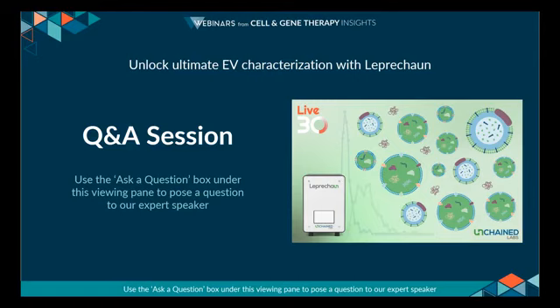As I say, we have an inbuilt negative control on each Luni, so if there is any non-specific binding, or if there's any fluorophore left over that hasn't been removed and is unbound and is sticking to the chip, to the Luni surface, then you will be able to see that, and it might be an indication that you need to optimize that cleanup step a little bit. But also, if you try that and you have any questions over how well your antibody is performing or whether the data looks good, then our technical teams can also help you take a look at that and suggest steps that you may need to take.